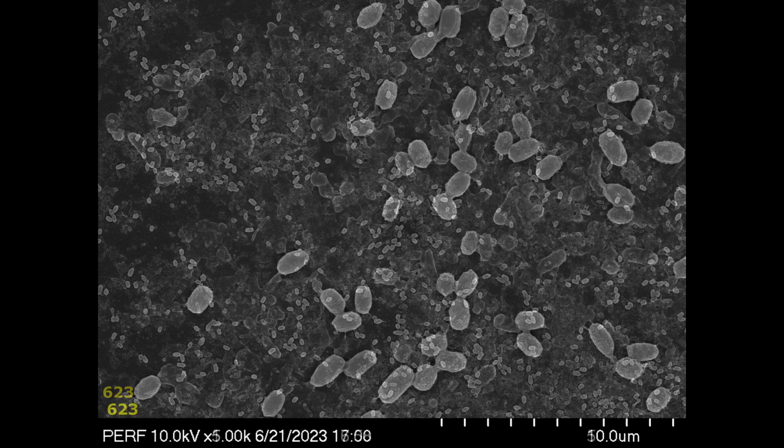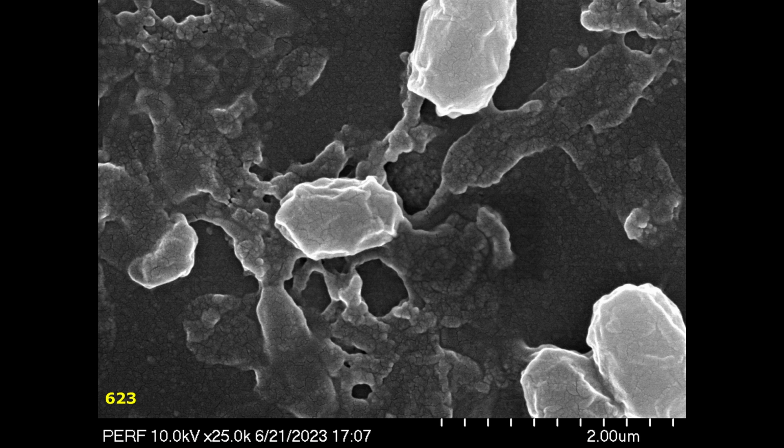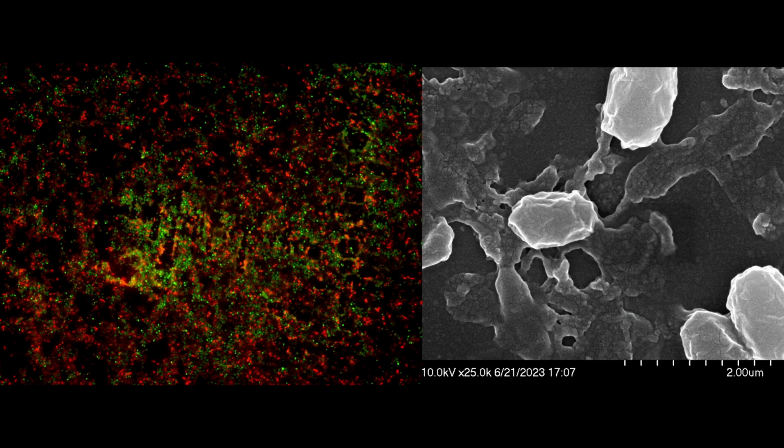And it was very interesting. You can kind of see where maybe I'm interpreting the dead bacteria as the subdued ones, and then the obviously living bacteria are also seen. So it was kind of an interesting experiment by accident. I should have some controls to do the experiment correctly, but I thought it was interesting.